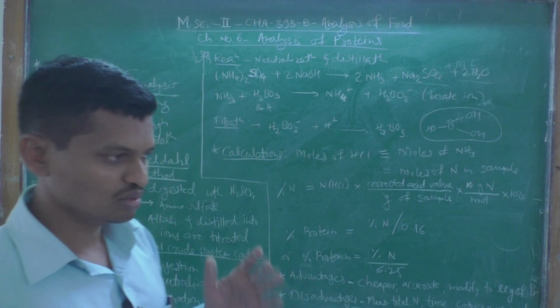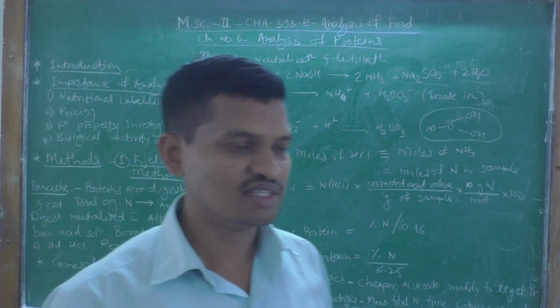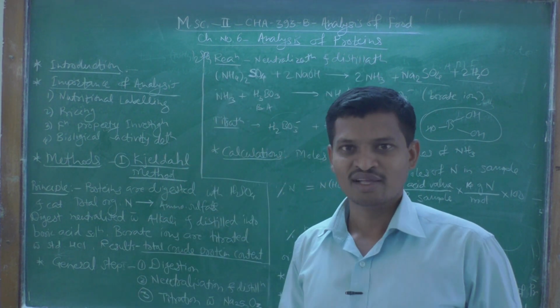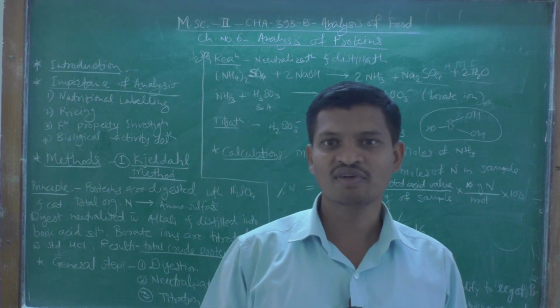So this is all about the first method, known as the Kjeldahl method. I think this is sufficient for today. The rest of the things in protein analysis we will see in our incoming video.